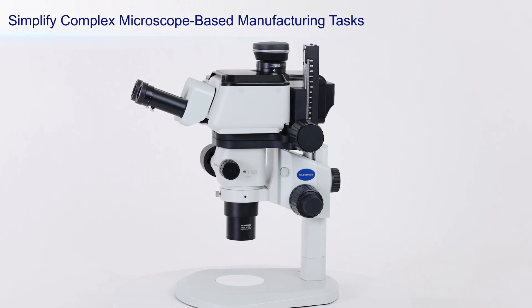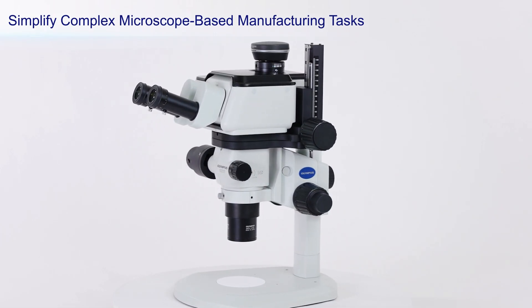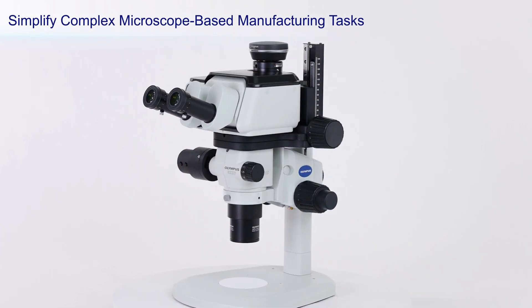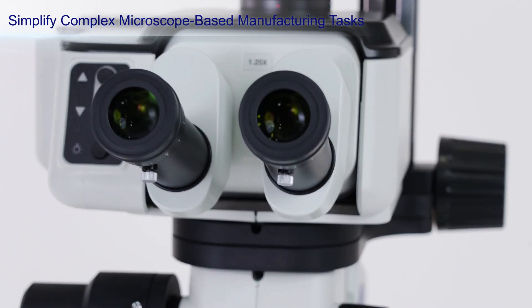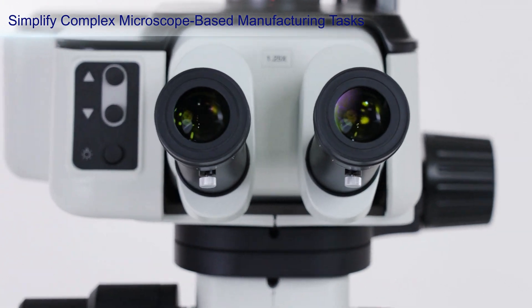The Olympus SCX AR-1 Augmented Reality Microscope System uses advanced projection technology to make the manufacturing process more efficient, from training to assembly.